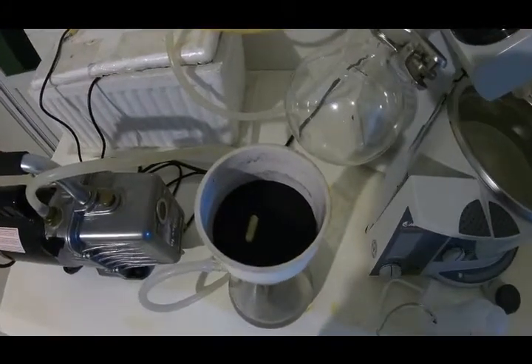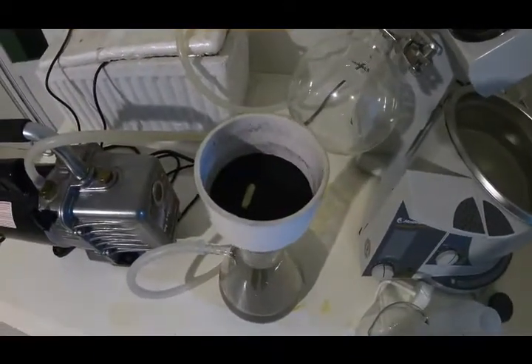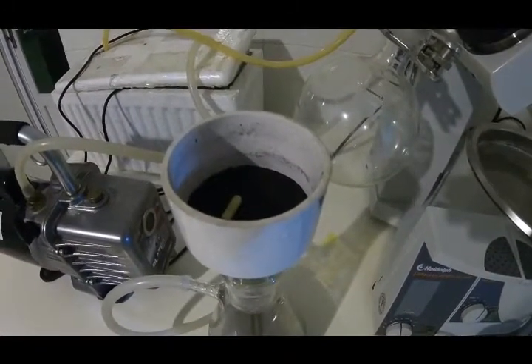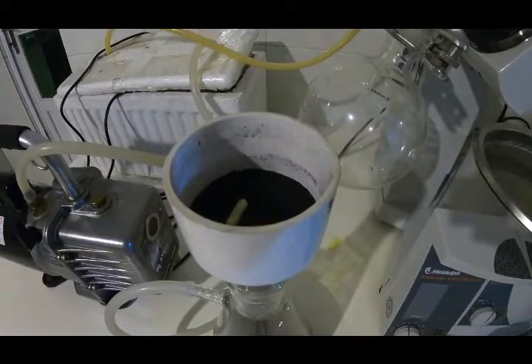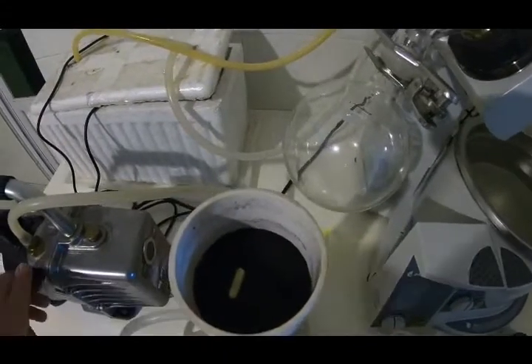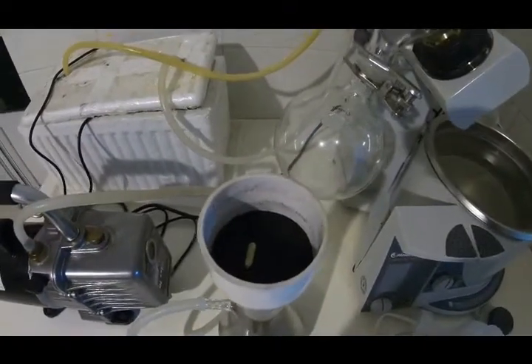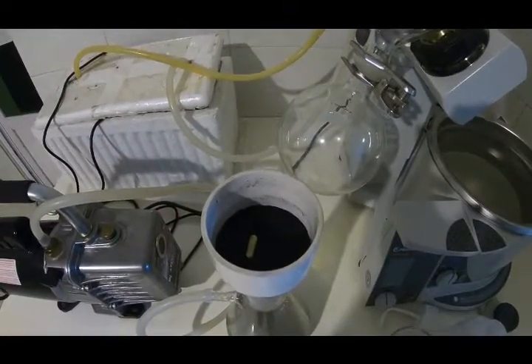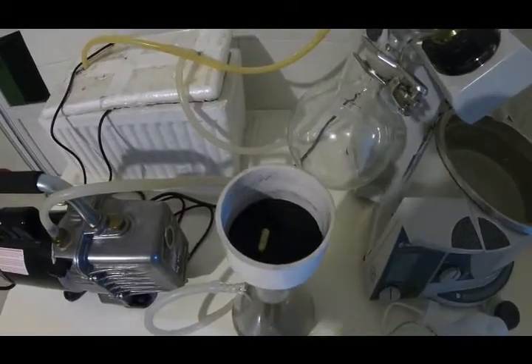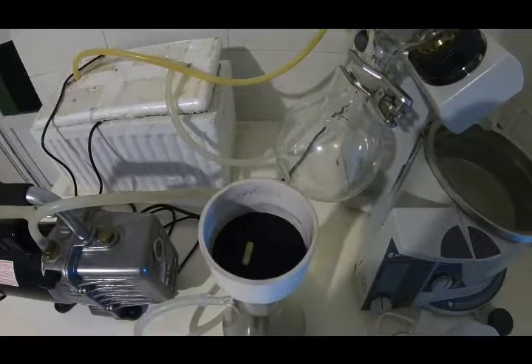Okay, I filtered it and I put the carbon under vacuum so it can be relatively dry, and now I just remove it from the vacuum and put it to dry at room temperature. Then we can store it. So here you go. Preparation of the 5% palladium on activated carbon.